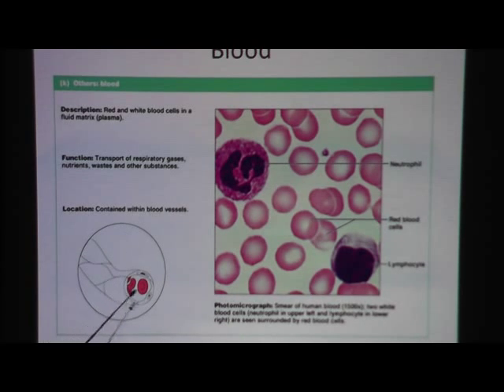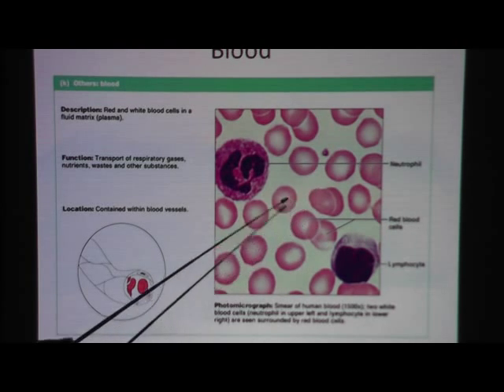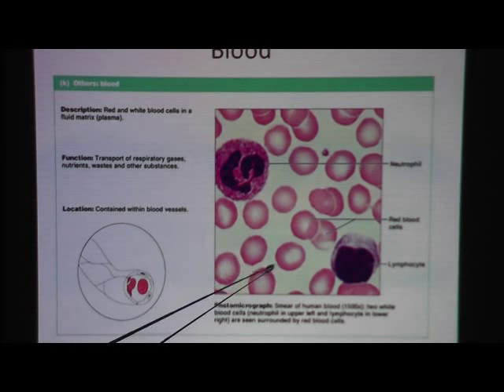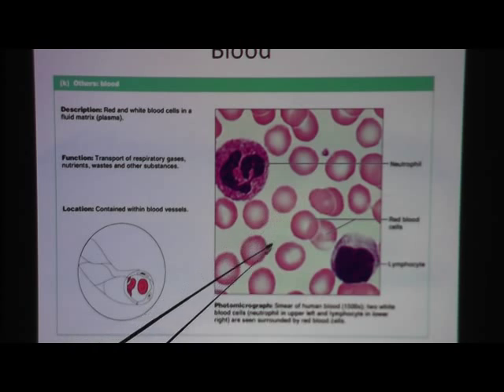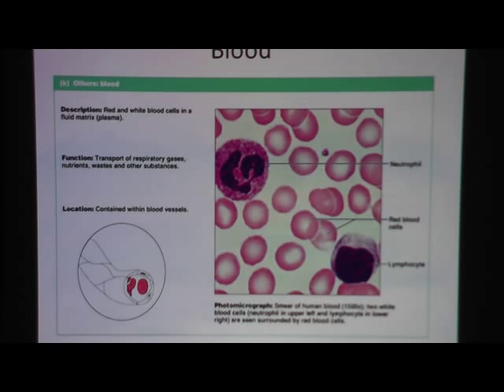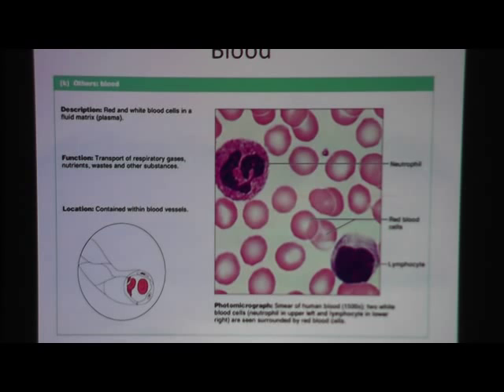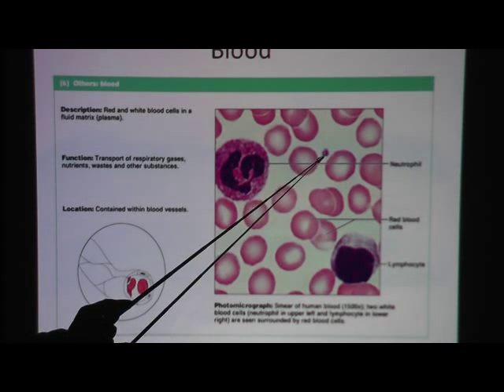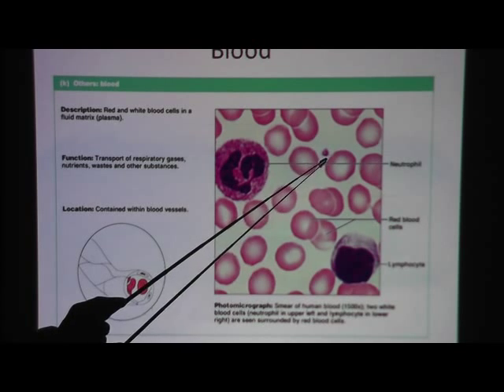Obviously, blood is found in blood vessels. Here is a sample of blood. These are red blood cells — there are many, many red blood cells, and perhaps that's why our blood is red, because there are way more red blood cells than white blood cells. These are white cells; they look very odd and kind of stand out like a sore thumb. Also, I want to point out — it's not on your list, but I do want you to know — this is platelets. This little smudge that looks like leftover dirt, that's platelets.